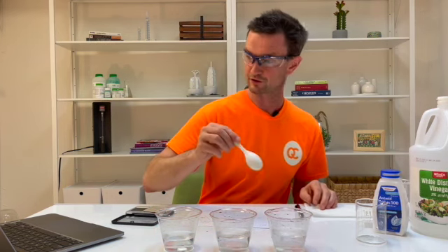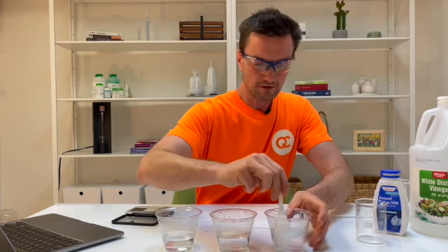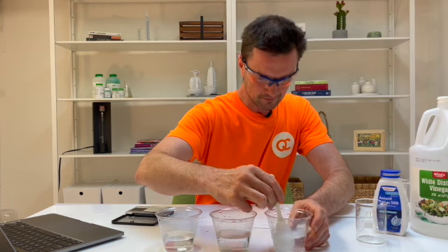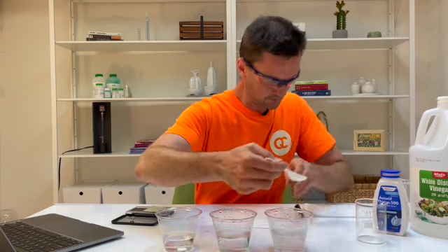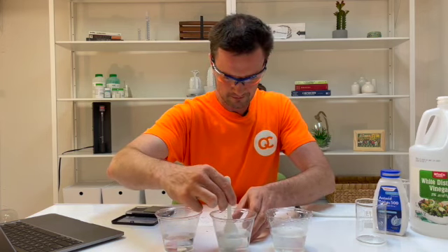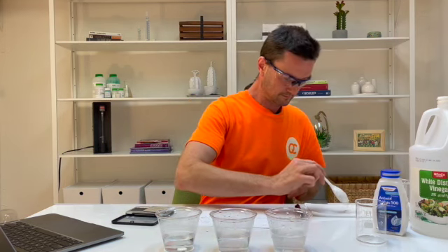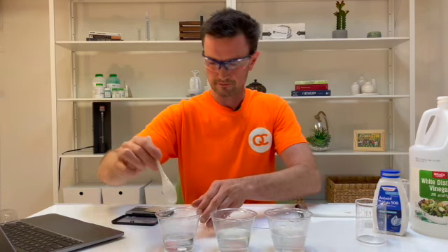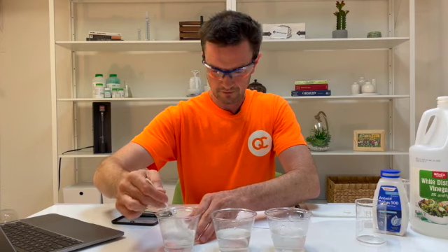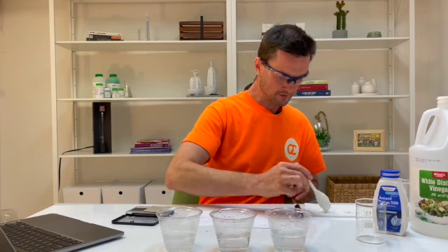Okay, I'm going to get ready. I've got 5 seconds. At the 2-minute mark, I'm going to take this one out. And then 10 seconds later, I'm going to take this one out. And then 20 seconds later, I'm going to take this one out. So let's pull this guy out. Set him on the left over here. Okay, 210. And a 220. So they've all been in there for essentially 2 minutes. Okay, I can stop my stopwatch.